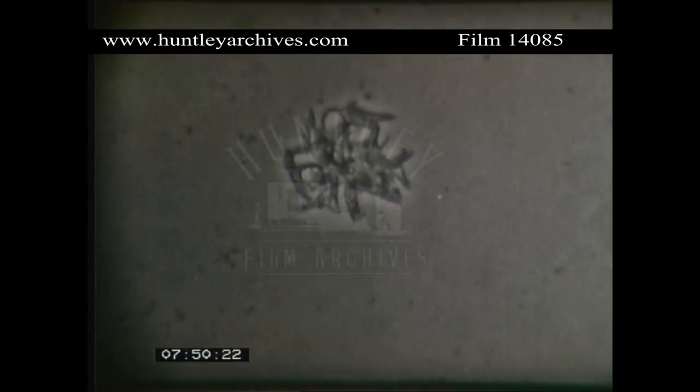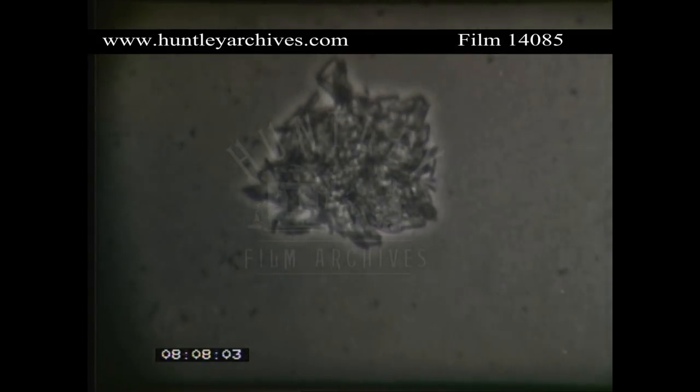The dose is now increased to 2 units, that is, 1/5 of the inhibitory dose. At the top of the colony is one cell now forming a loop. Although derived with the others from the same parent cell, it is more sensitive to penicillin and will burst, while all the other cells appear to develop normally.